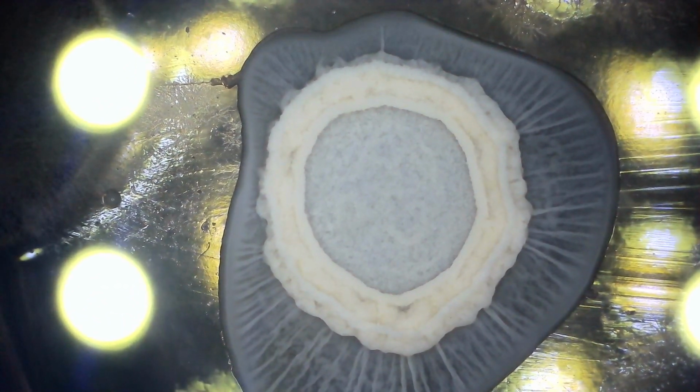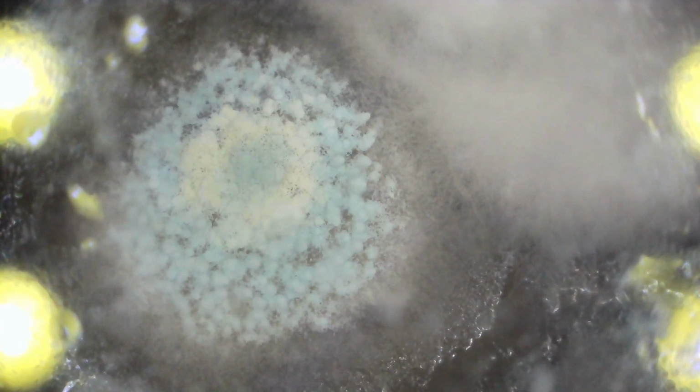And that looks to the naked eye very similar to this one, which is the control for this set of dishes. Oh, that looks awesome. Yeah, this one here is definitely my favorite. Look at that. Look at that disgusting thing. Awesome. Right, what else can we look at? You'll have to refocus for these ones because they'll be on a slightly different plane. But that looks like a different one. It looks superficially similar to the other one that we saw in the control, but it's got sort of that lime greeny blue nodules, which looks substantially different.